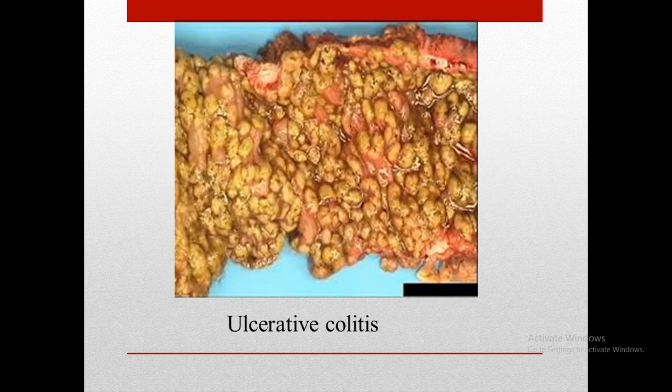Now this is colon, cut again longitudinally like this and opened. Now here we have many ulcers, and in between the ulcers the mucosa is not healthy. The mucosa in between is edematous and elevated, which we call pseudopolyp. This is characteristic of ulcerative colitis. Ulcerative colitis is one of the two diseases which we call inflammatory bowel disease, IBD. In ulcerative colitis, we have pseudopolyps and cryptitis. Cryptitis can't be seen by gross, it's seen under the microscope. Here what we see is multiple ulcers separated by pseudopolyps.